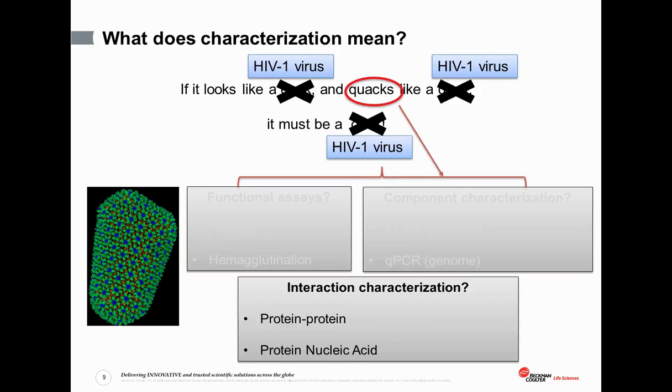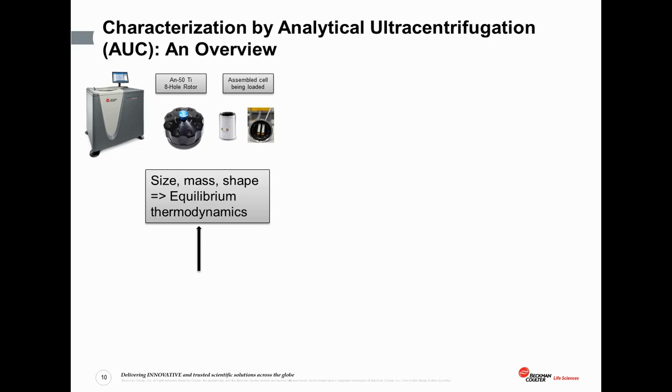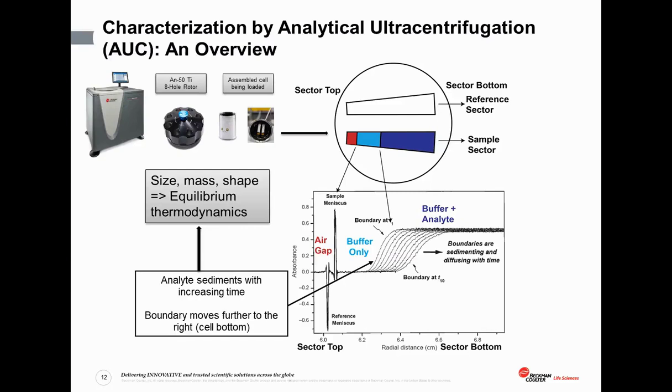And that's kind of the region where we first want to focus our efforts. We want to talk about interactions, protein-protein interactions for the most part. Now, I'm going to jump ahead a couple of slides very quick. Okay, the technique that we are going to be using in all of the case studies that we're going to talk about today is analytical ultracentrifugation, or AUC.